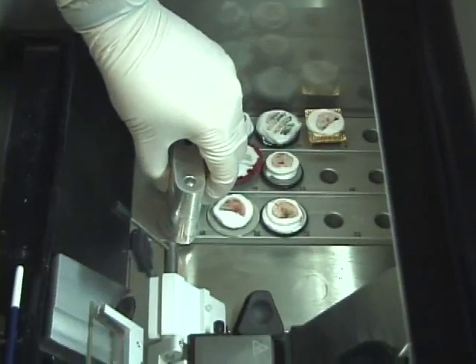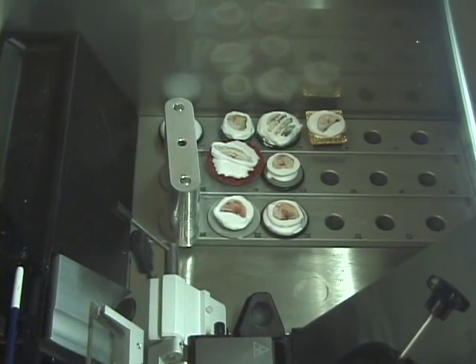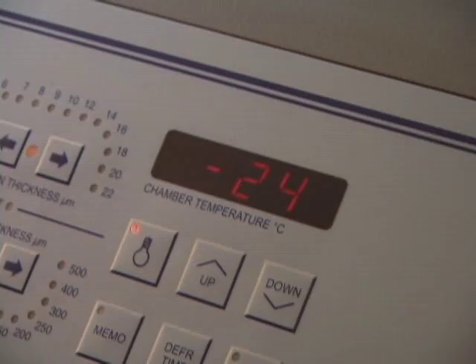The embedding device fits down inside the cryostat and assumes the temperature of the chamber. Because tissue is mostly composed of water, it is the moisture in the specimen that will cause it to adhere to the cold disc.